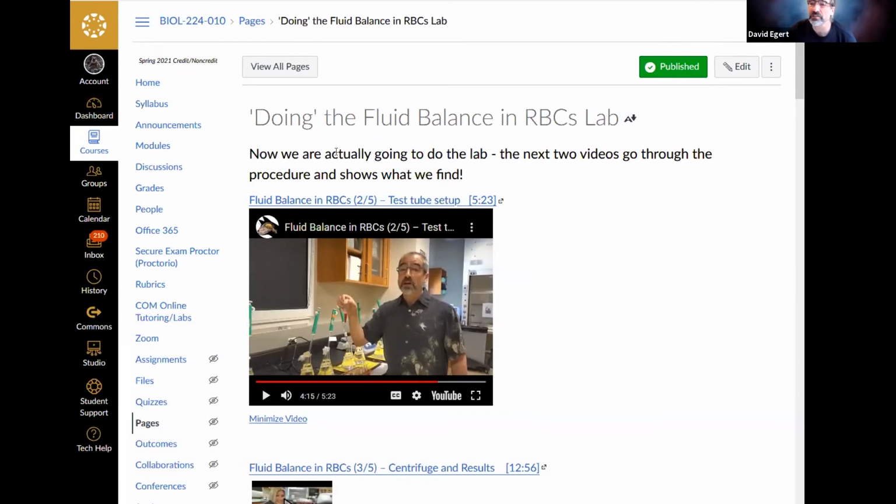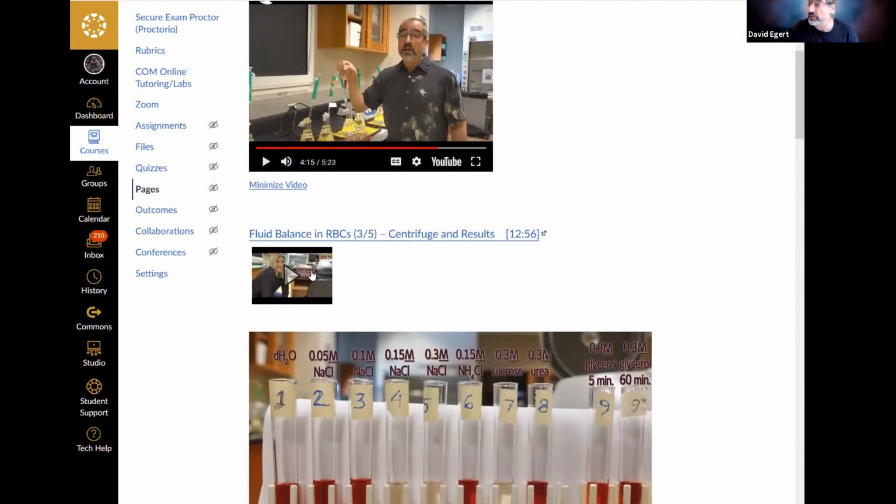All right, so any questions about the setup of everything? It makes sense. We just took the different solutions and put the exact same amount of blood in every one. And again, it's important that the volumes are all the same, because when you spin things in a centrifuge, if it's off, you're going to have the thing doing this, minimally walking. Worst case, it's going to fall off, or you don't want to have it fly apart and get shrapnel or whatever. So that's the setup. And now we're going to have the centrifuge and the results.